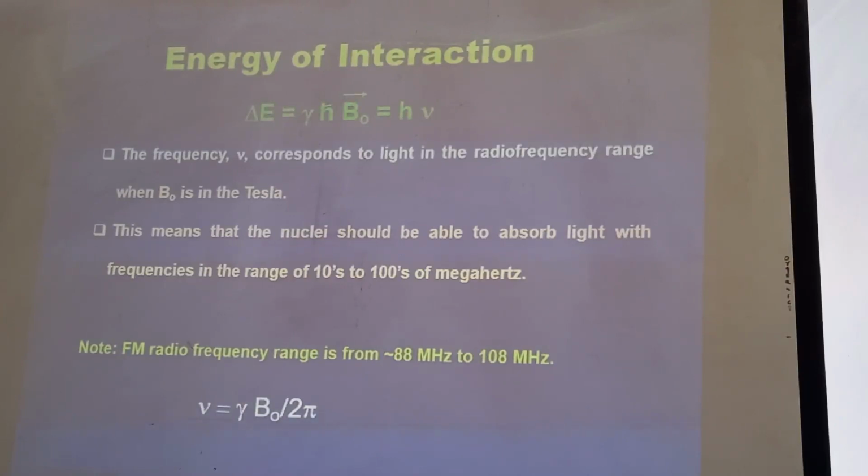You get a spectrum for protons only, you don't see any carbons. That doesn't mean that your compound does not have carbons. You cannot see them because you are not resonating your carbons, you are only resonating your protons. You have tuned your radio frequency transmitter to the frequency of protons only.